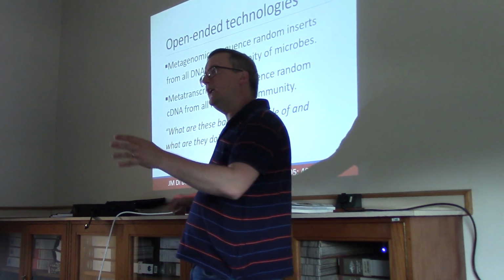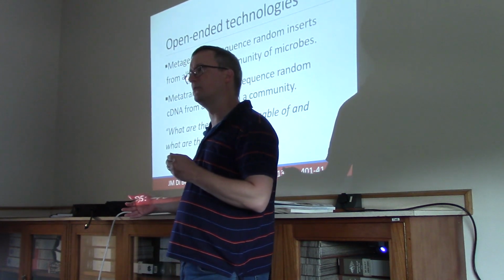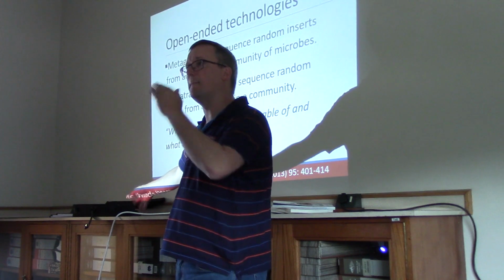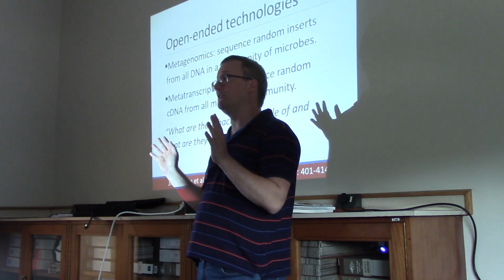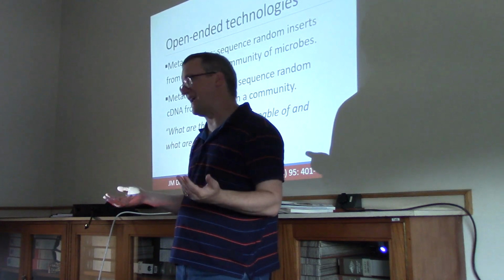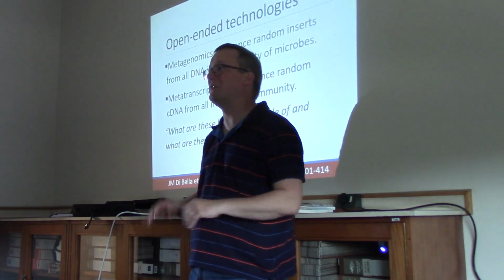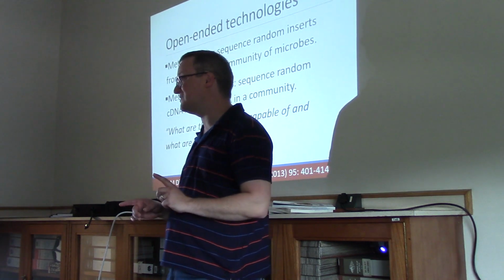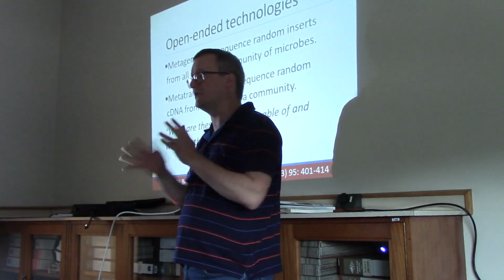And now, when we look at the BAM file, the FASTQ file that's been produced by the sequencer, we can look at where all of these reads map to species we believe to be present. Right? Now, maybe you're really aggressive and you have downloaded all of GenBank, something awful like that, and you're now trying to map all of these reads to all of GenBank. Okay, that's a bad scenario, we don't want to do that. But mapping is a relatively fast exercise, and you can map all of these reads to all of these genomes that are known to exist.